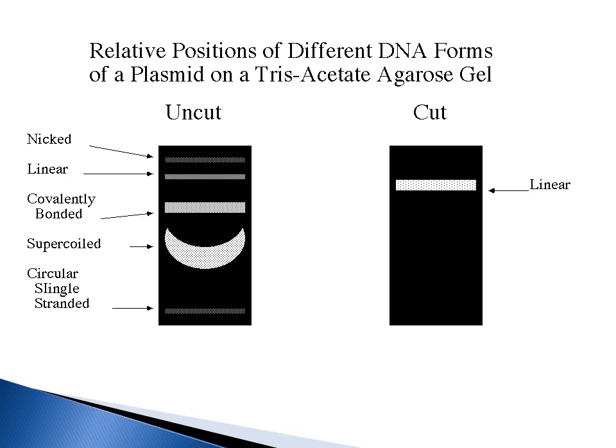If you were to take your plasmid DNA and digest it or cut it with an enzyme, you would completely linearize it. So the only thing you would see on the gel is the linearized plasmid. You would no longer see the nicked or the supercoiled plasmid.